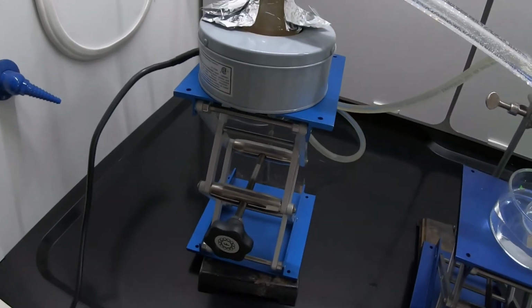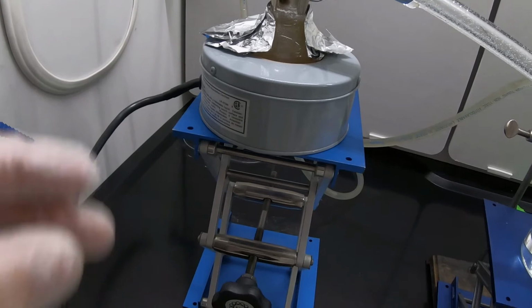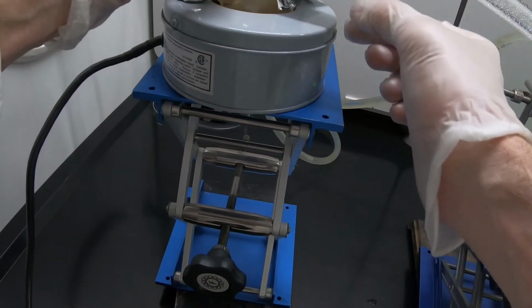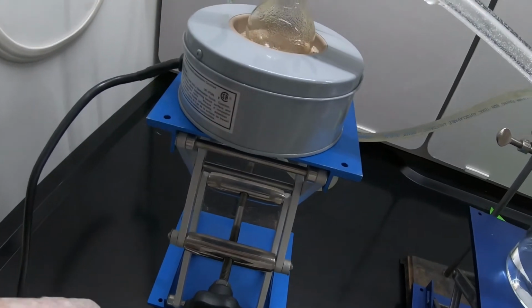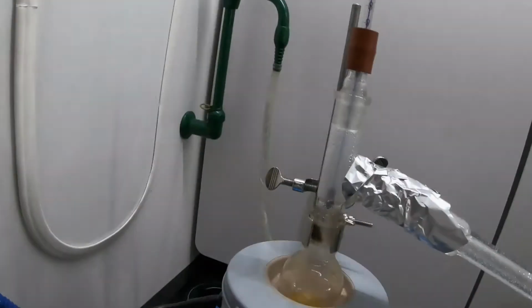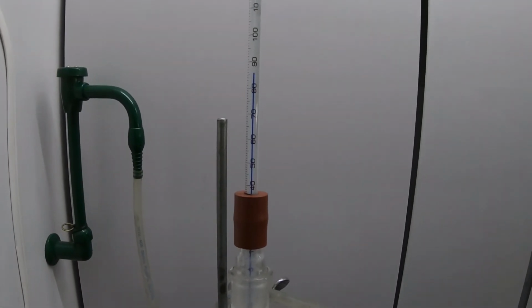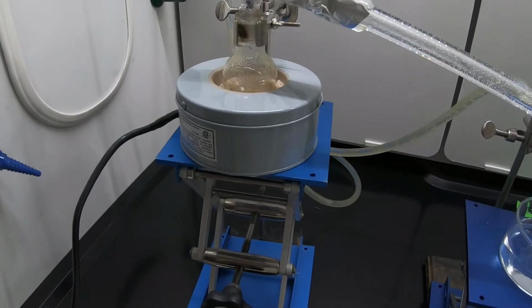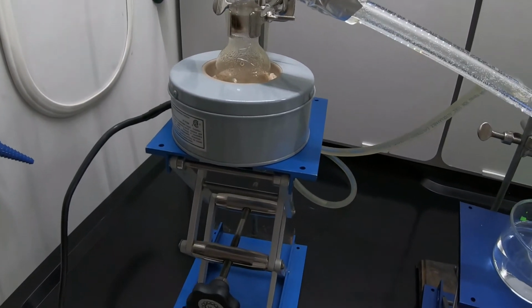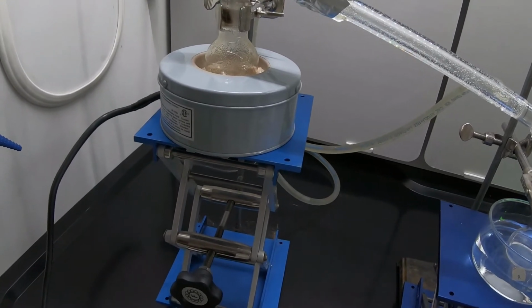Okay, we're at about the 21-minute mark, 22-minute mark, and I'll pull this back a little bit. Got a bit of an orange color happening. The volume is really quite small, and more importantly, what we see is the temperature is starting to drop on the distillation. Right now, we're at about 86 degrees. It's not that the solution is cool by any means. It just means that vapor is no longer being driven over because we've driven over most of the product.